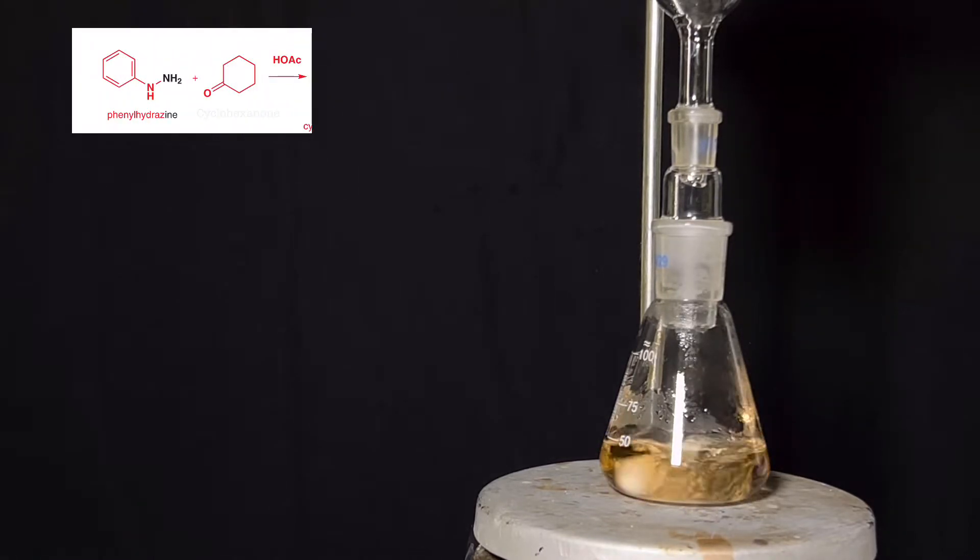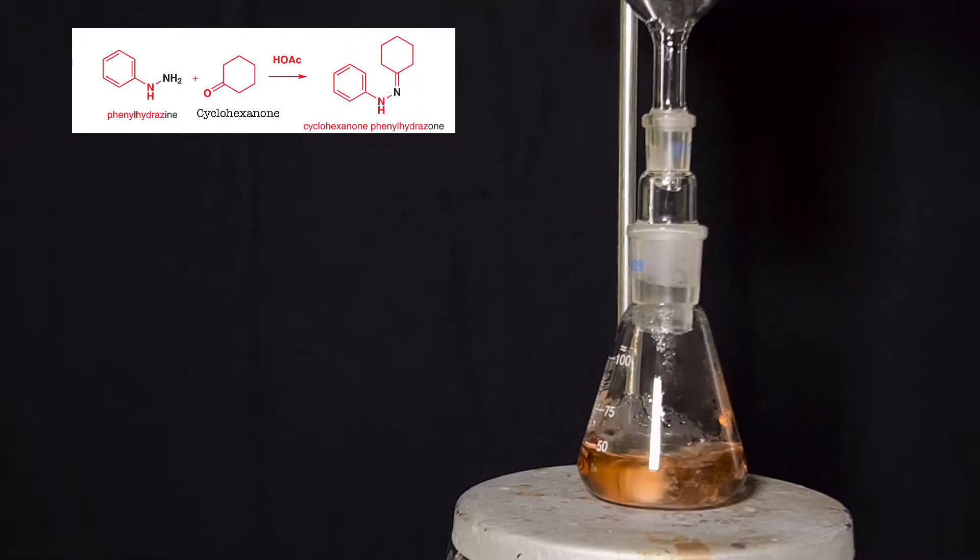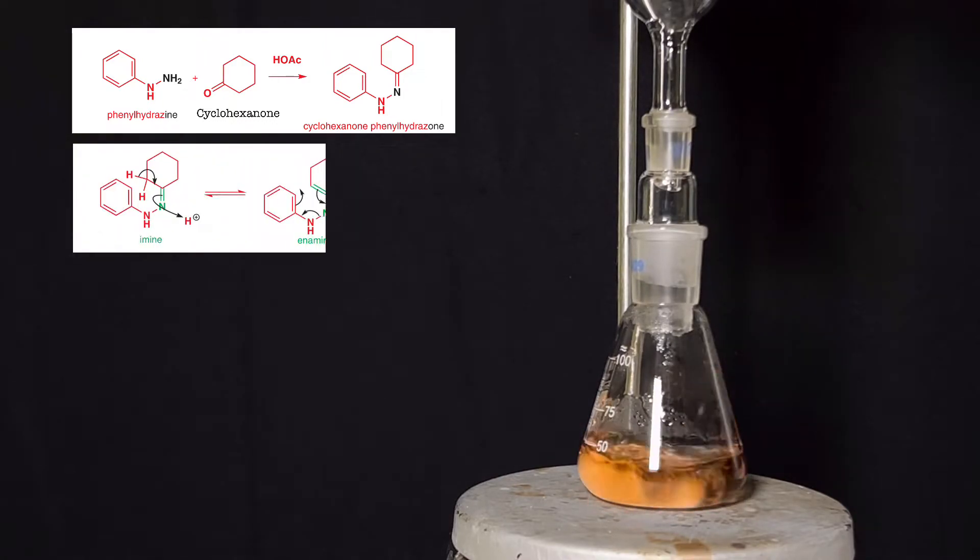Initially, phenylhydrazine condenses with cyclohexanone to form the cyclohexanone phenylhydrazone. This hydrazone then tautomerizes to the enamine.